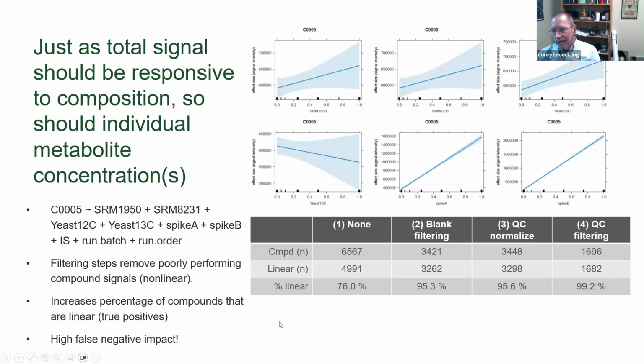And so this also highlights one of the challenges with coming up with any gold standard benchmark by which to compare. Right? If you're evaluating your processing software, the question is, which of these is the right answer? And I'm not sure that I know the answer to that. But we have a data set and we have a process which will enable us to evaluate processing performance and the impacts of it.